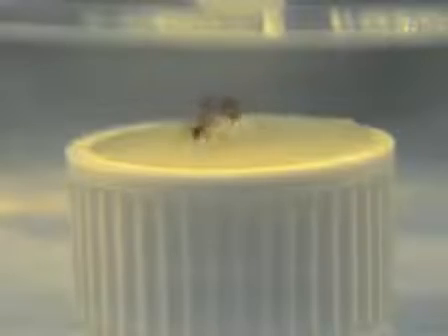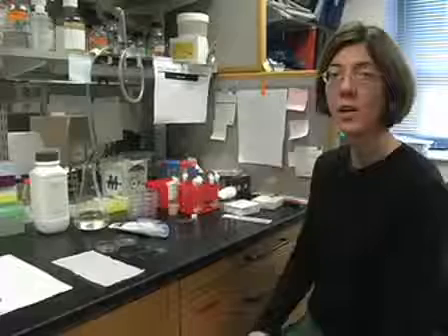My name is Sarah Sertel, and I'm a postdoc in Ed Kravitz's lab here in the Department of Neurobiology at Harvard Medical School. My name is Sibu Mundina-Purit. I'm a medical student from Germany, and I'm doing a research rotation here at the Kravitz lab. We want to show you how we set up fights and study aggression in fruit flies.